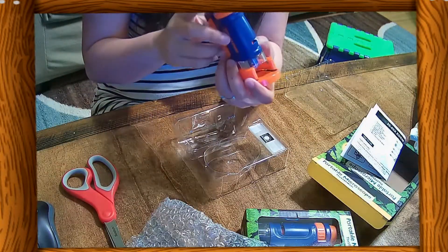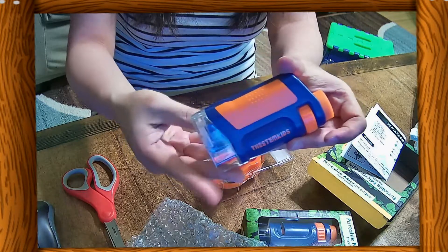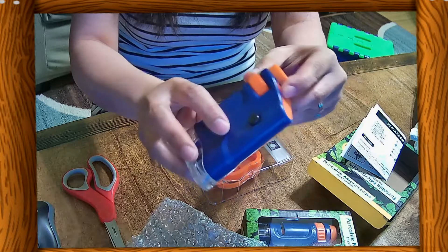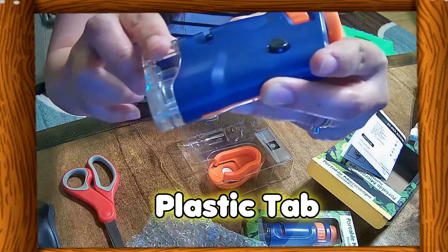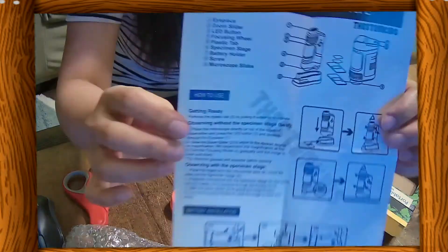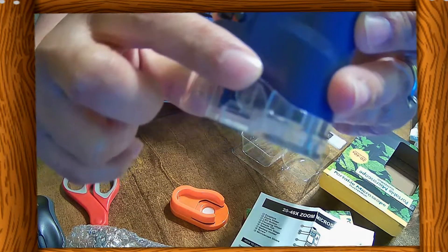Just like this, it's very easy to put together. Let me show you the parts of this microscope: here's the eyepiece, the LED button for the light, the zoom slider, the focusing wheel, a plastic tab, the specimen stage, and the battery holder.